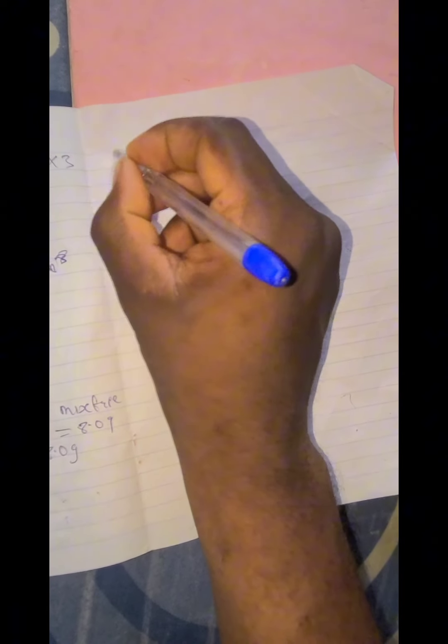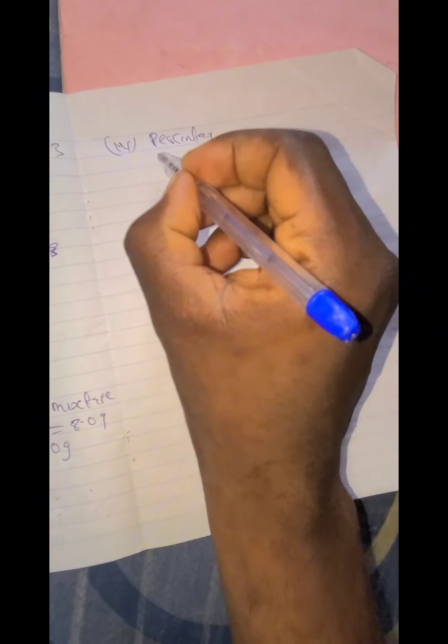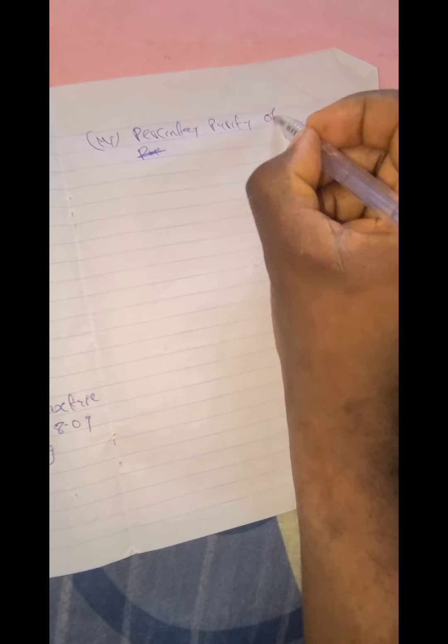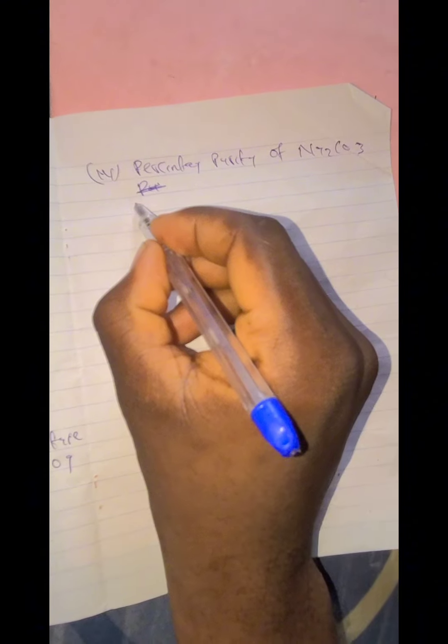So our IV, we have the percentage purity of sodium trioxocarbonate. If you know the percentage purity, it's very simple. What is the formula for percentage purity? Let's bring out the formula first.